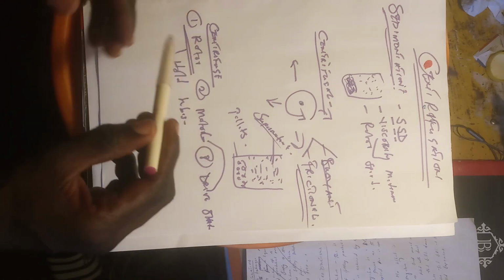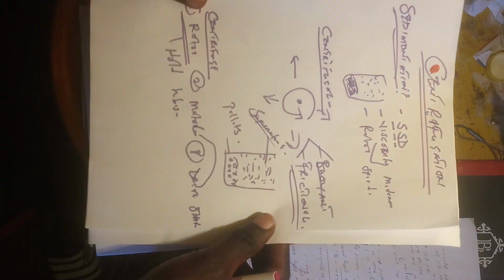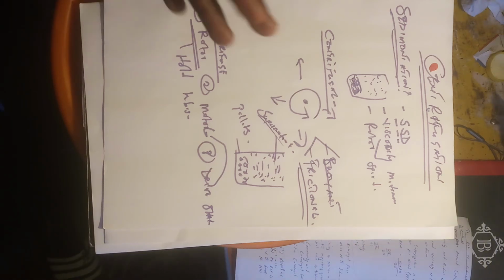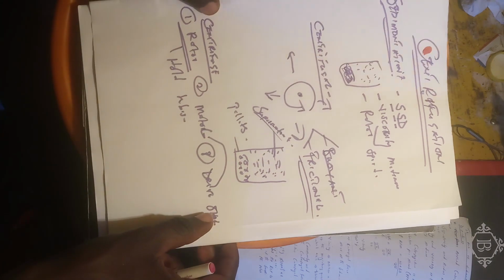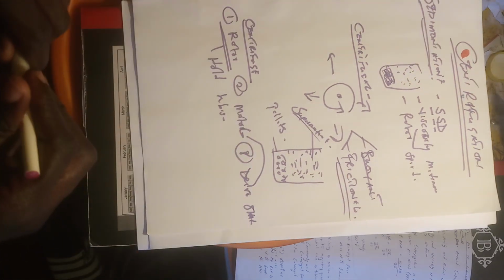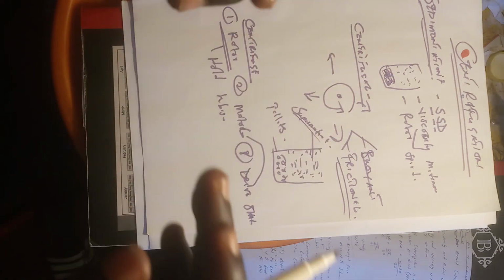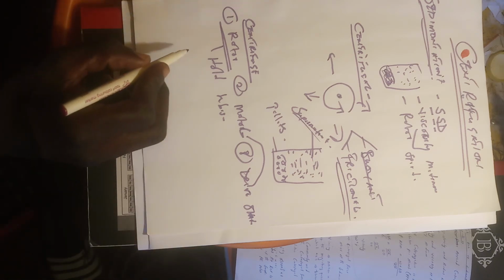But rotor, again I insist, don't forget what a rotor is, because it may prove to be very, very helpful if you understand what a rotor is. So now, after looking at what a rotor is, we can look at two basic formulas that we should always remember in this centrifugation process. If there is time, I would love us to look at these formulas in detail and how they are derived, so that we get the basic concept.